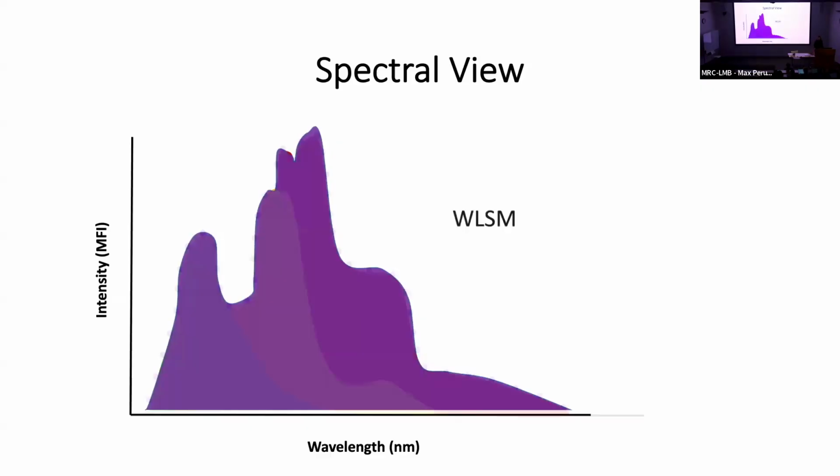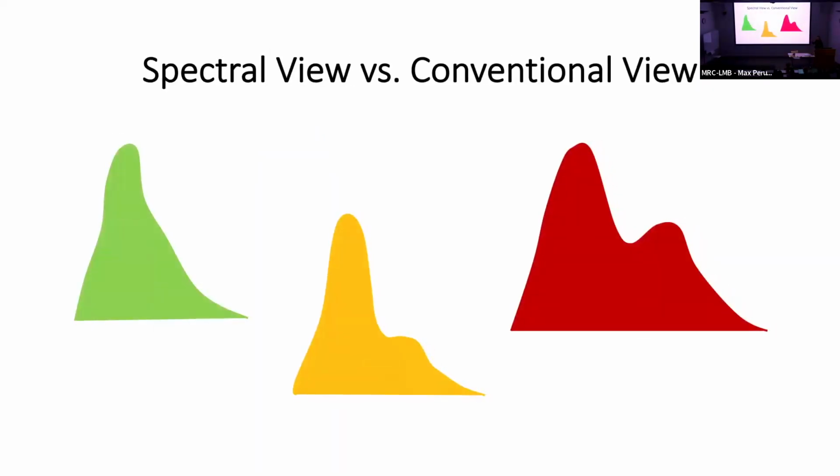Using a weighted least squares unmixing method, you are fully unmixing all of those various profiles from one another. And again, you're still going to face certain reductions in sensitivity and readouts, because that's just the way it is.